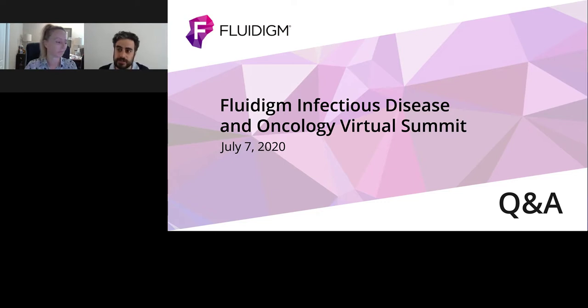Yeah, so as discussed in the presentation, there are some advantages to using single-cell technologies and others to using imaging mass cytometry. But in the lab, we also see both as highly complementary. So what we've been trying to do is to project the single-cell sequencing data on gene expression back to the images. What we do is use common markers between the single-cell data and the imaging data, and determine the probability that a certain cell from single-cell sequencing belongs to a certain part of the tissue.